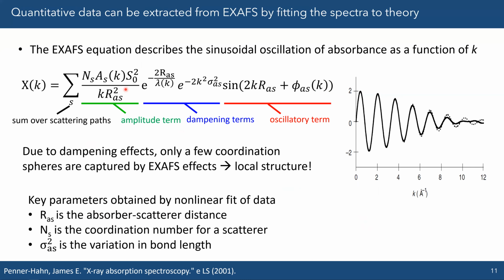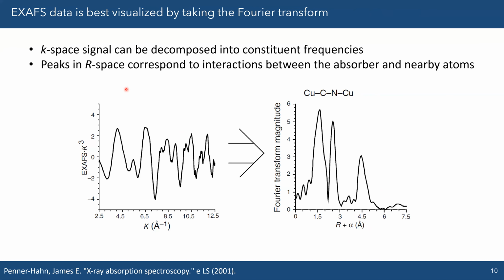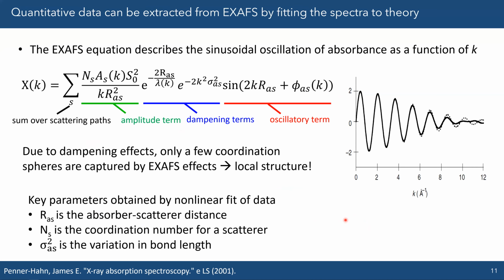But with fitting, you'll be able to resolve this issue. But fitting is just pretty complicated for XAS. And if you don't want to deal with fitting, from personal experience, if you can choose not to deal with trying to fit XAS data, don't do it. And a PDF would just be a much simpler way of trying to get that distance.